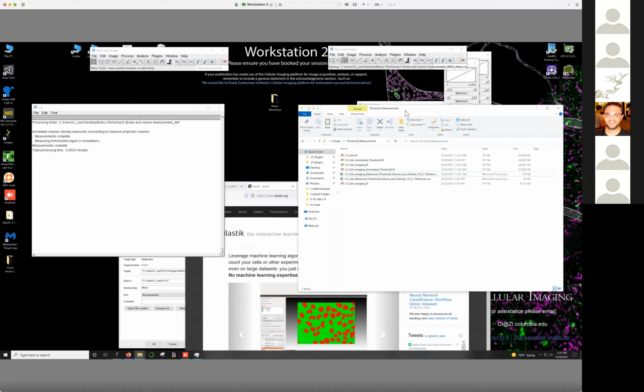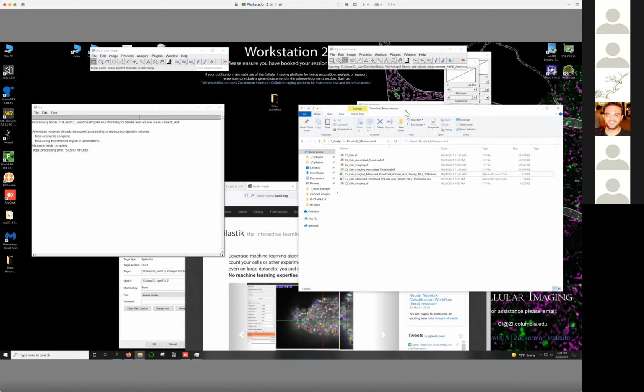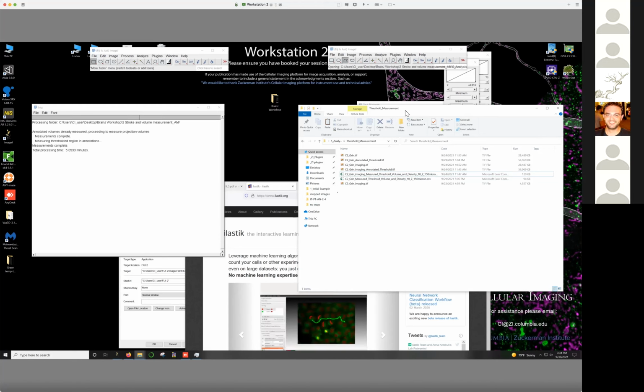And I'd say also, definitely reach out to us if you want to start using the deep learning on the spinning disk or the slide scanner, because I think that's really the way forward, is using that segmentation at the microscope. It's just a few seconds of processing time after it takes the image, and then you have the locations of the cells, all the axons and dendrites, and then the analysis side becomes very easy, because you've done the hard work at the microscope. And I think the results are potentially a lot better because you can have a lot more robust and reliable segmentation using those tools if it's trained well.